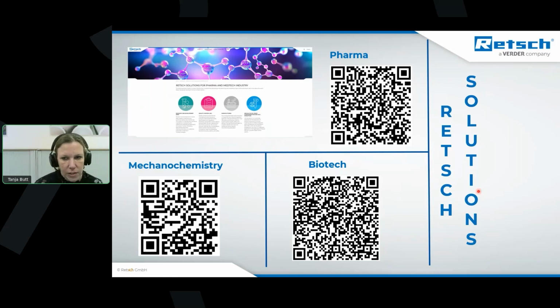And once you activate it, you cannot use it without signing in. So it always needs to know who is working with it, when, and what is done. So you can also not delete any results. The Pro version simply has all the functions without this user management and e-signature audit trail stuff. So in principle, they are very similar to each other, but there are some more extra functions in the pharma version.